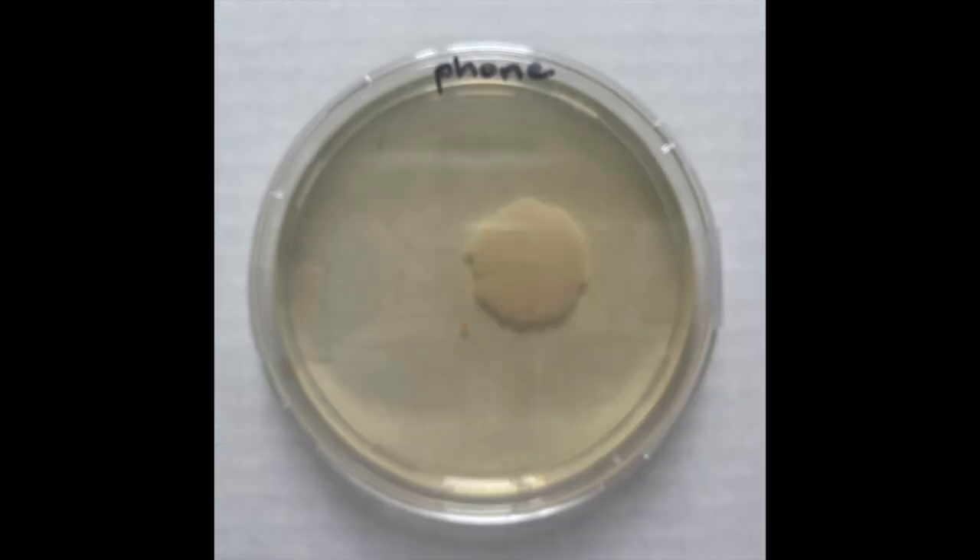Next, we're going to take a look at the cell phone. Here you'll see multiple colonies as well. There's one very large bacterial spot that's an off-white color, and also a small red spot, which indicates this could be another type of bacteria living on this particular cell phone. The University of Arizona did a study and found that cell phones can carry up to 10 times more bacteria — they compared it to a toilet seat cover.